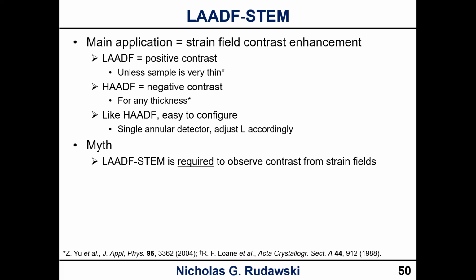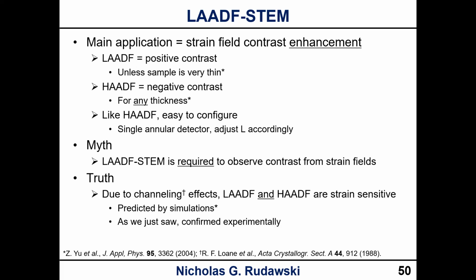I do want to state, because I think this is a myth that some people have, that LAADF-STEM is required to observe strain fields, or specifically the contrast from strain fields, and that is simply not true. The truth, of course, is because we have to account for channeling effects, both LAADF and HAADF are strain sensitive. This is predicted by simulations, as you can see below, and as we just saw with the example of the dislocation loops in silicon, this is also confirmed readily experimentally.